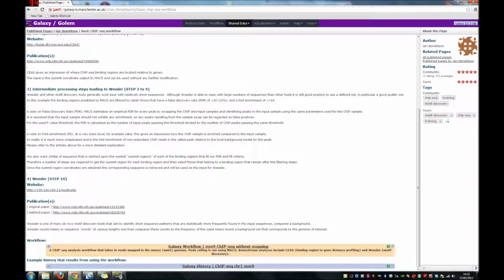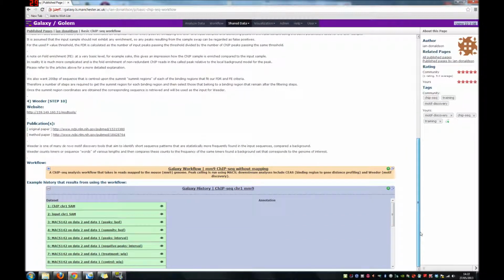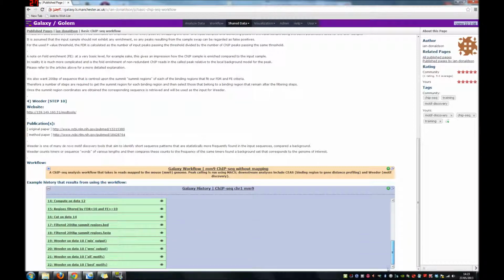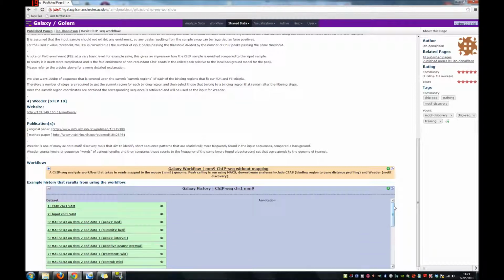Also I'm able to embed the history that I created. So like the history we created in this tutorial, this is the history that I originally produced and then used to create the workflow. So this looks just like we've produced in this series of videos.